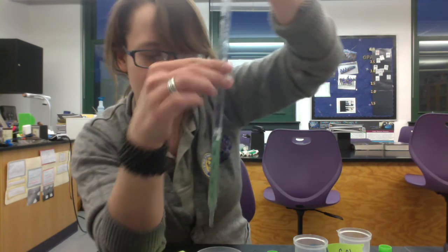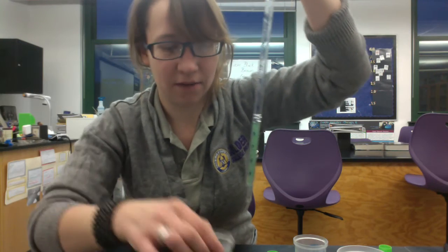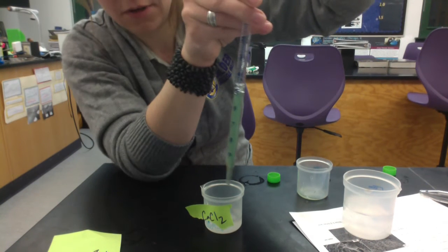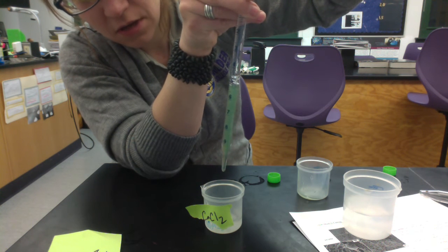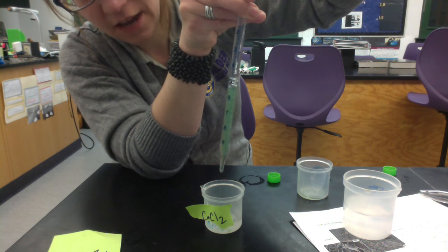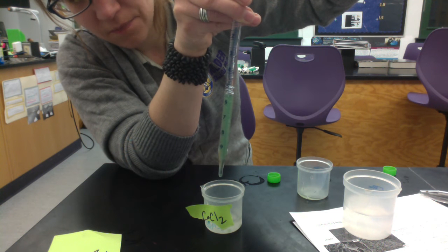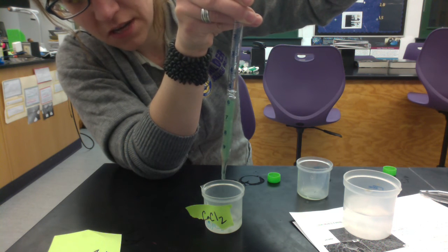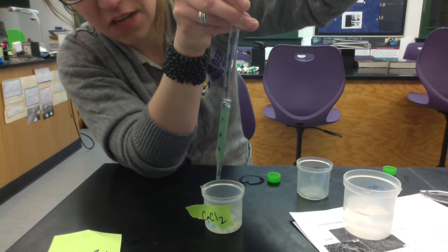Now I have an algae-alginate solution in my pipette and I'm going to start making my spheres. I take my pipette over the calcium chloride and let the alginate-algae mixture drip one drop at a time into the calcium chloride. As soon as that droplet hits the CaCl₂, it's going to immediately cross-link the alginate — the calcium ions will cross-link the sodium alginate — and we start to form a sphere. It perfectly captures the shape of the droplet as it hits the solution. Continue until all the solution in your pipette is gone.